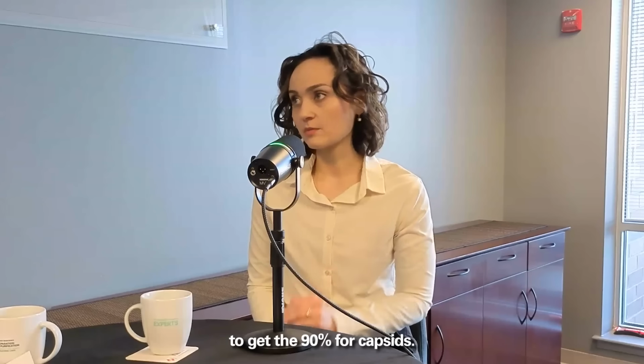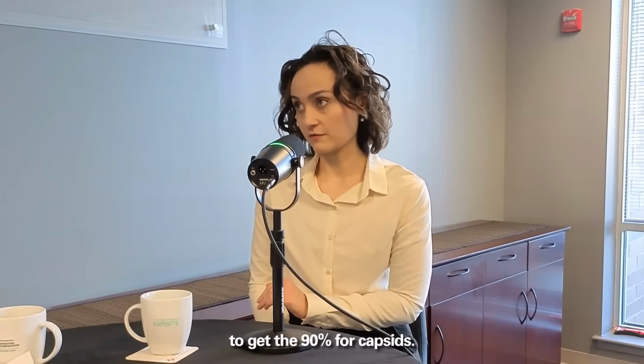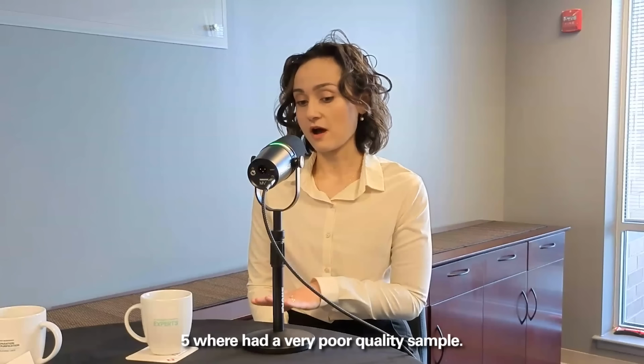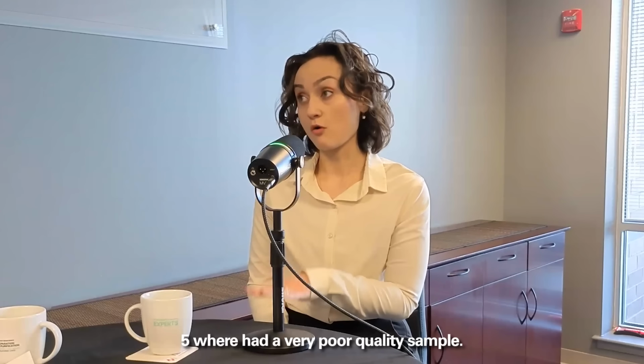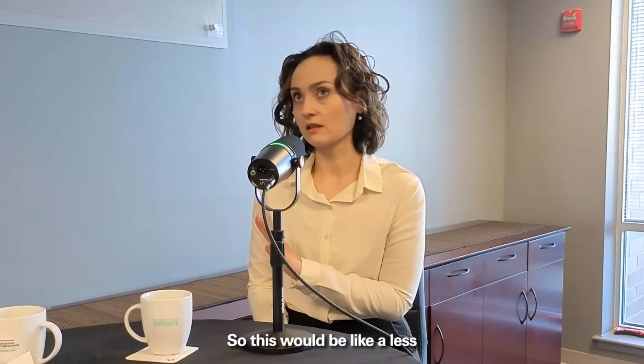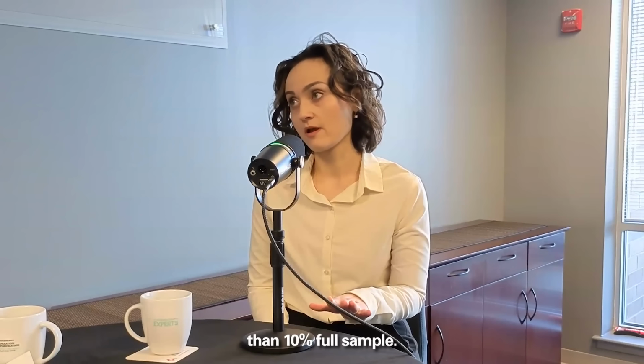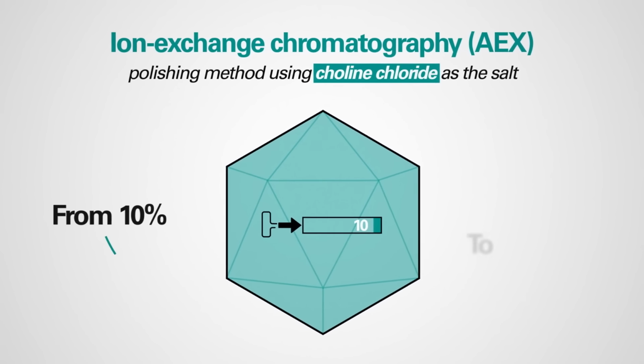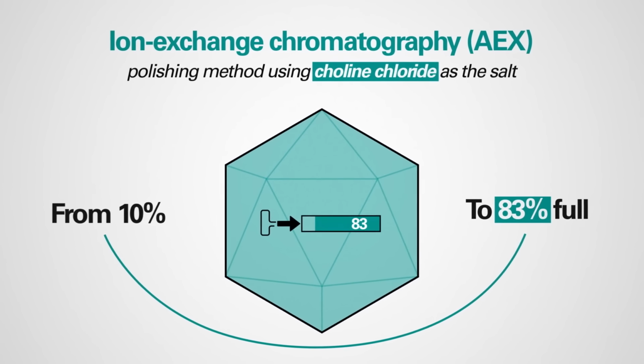So that's how I was able to get the 90% full capsids. However, there was an example with AAV5 where we had a very poor quality sample, less than 10% full. We were able to change that from 10% full to 83% full in one step.